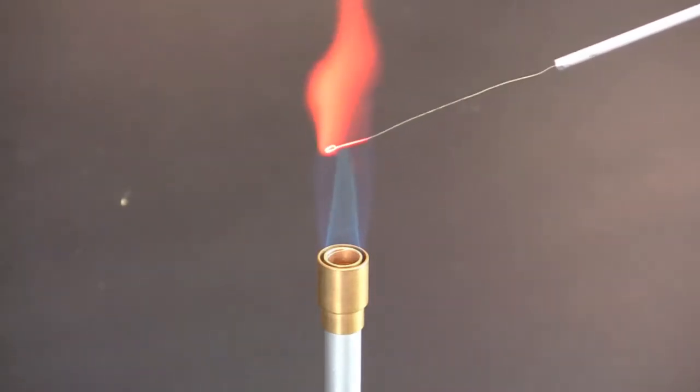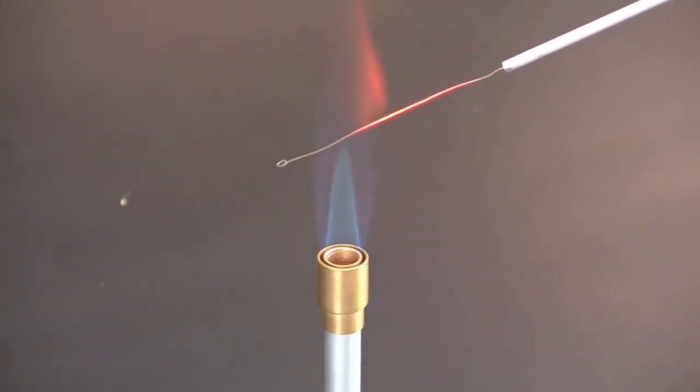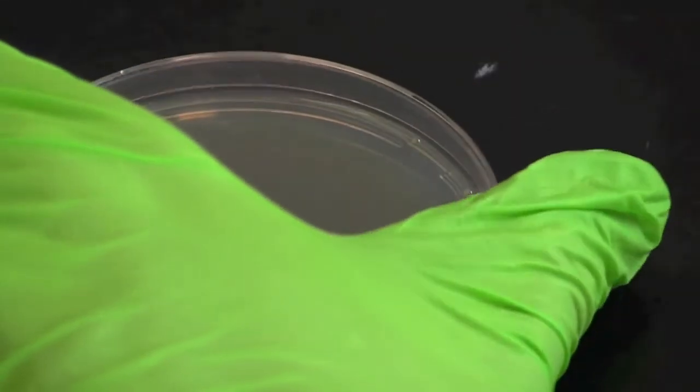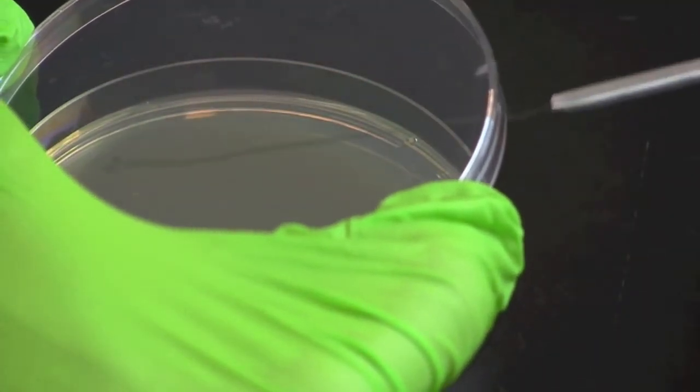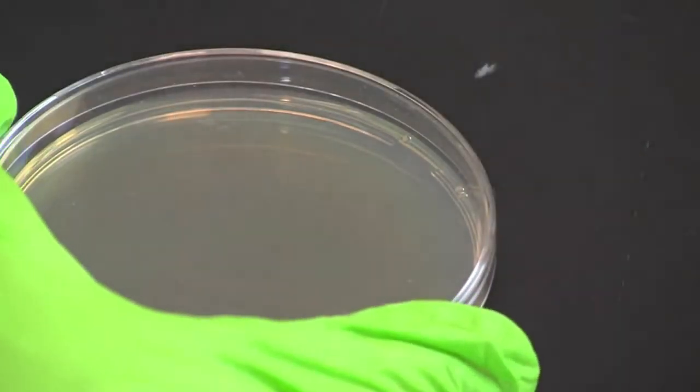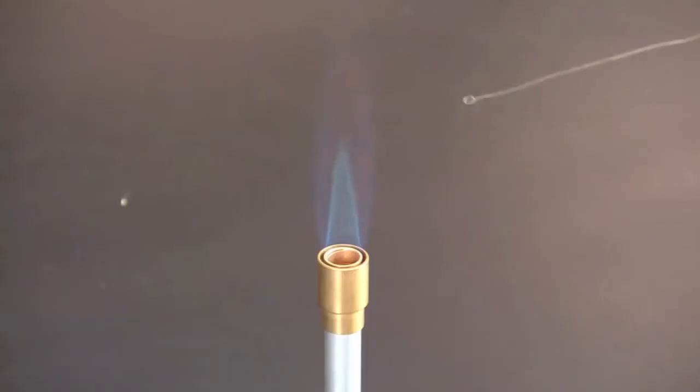Flame the loop, then draw it through one end of the second streak and rub the loop back and forth in the third quadrant about ten times. When finished, flame the loop again.